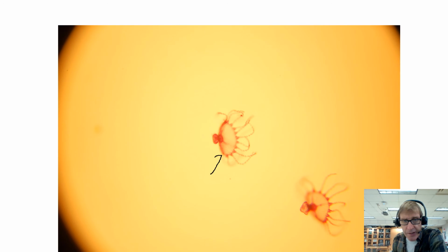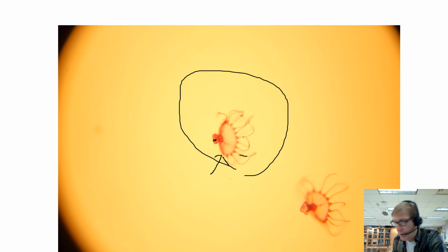These little things, of course, they're medusas. That's what budded off of that reproductive polyp, that asexually reproducing polyp. These little medusas swim around in water. You've got tentacles, mouth would be at this end. They're a little kind of inverted in the slide, but it's just an example of a medusa, the mobile form, and it's in the phylum Cnidaria.